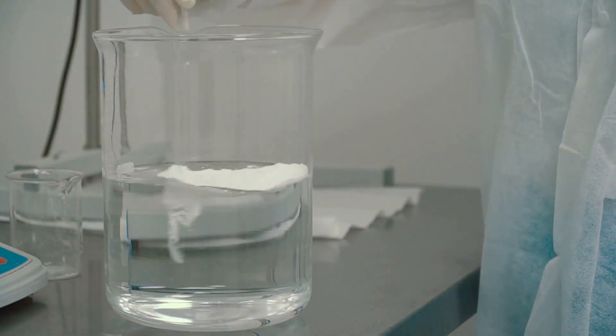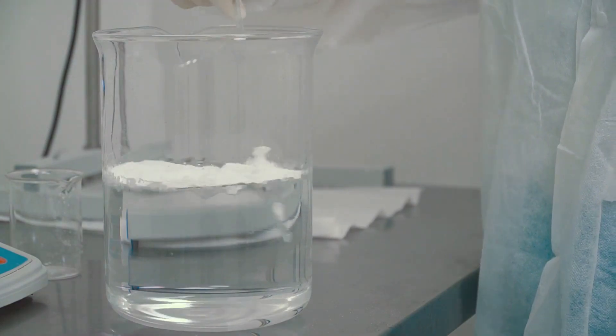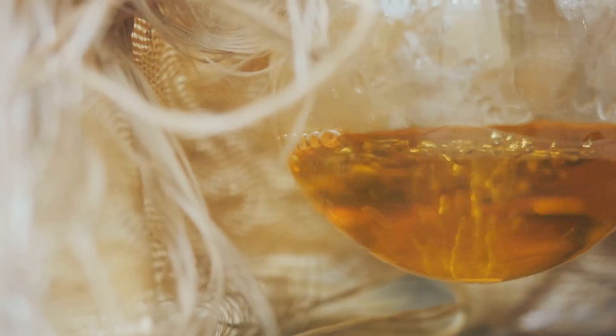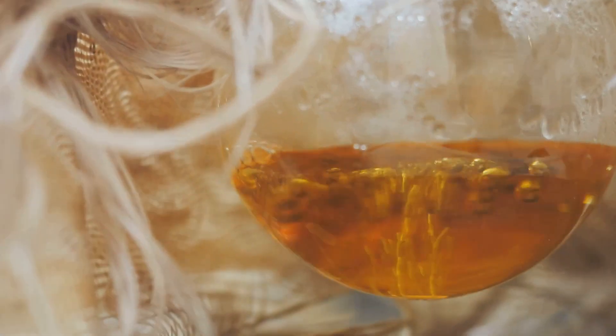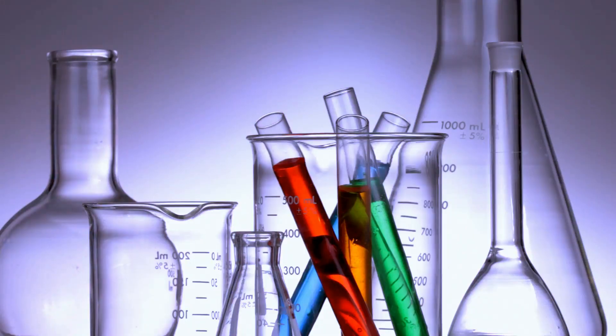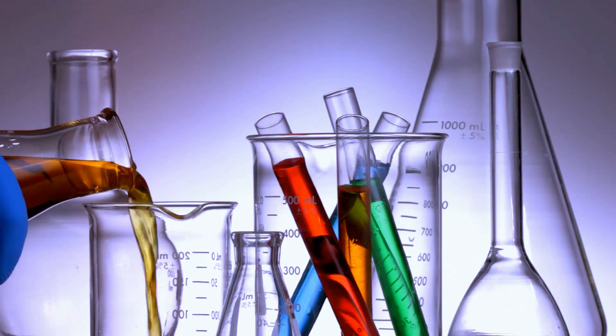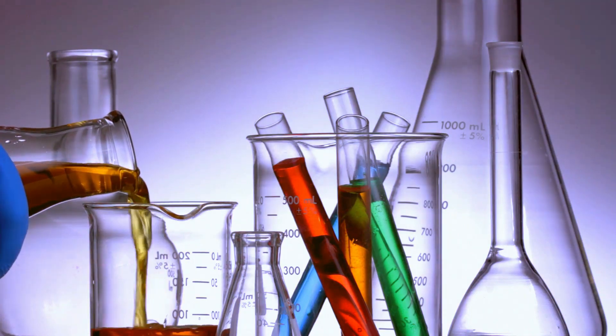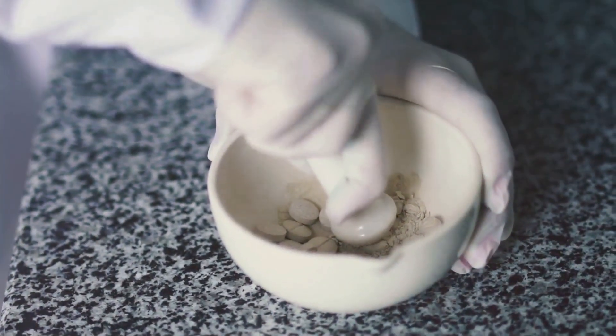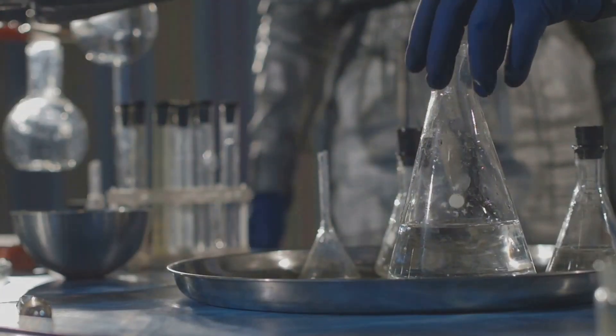When added to the aqua regia solution, sodium metabisulfite reacts with the gold ions, converting them into metallic gold particles. You'll see the solution turn a cloudy brown as the gold precipitates out. This process can take a few hours, so be patient. Once the precipitation is complete, you should see a brownish sludge settled at the bottom of your beaker. This sludge is mostly metallic gold. We're getting closer to our goal.